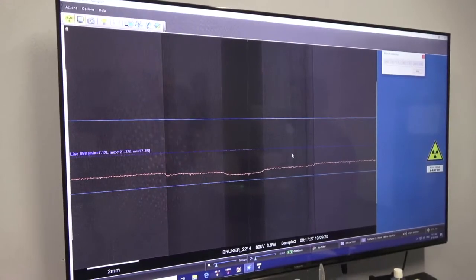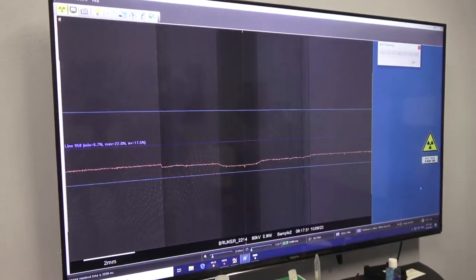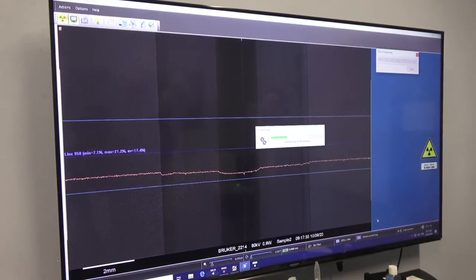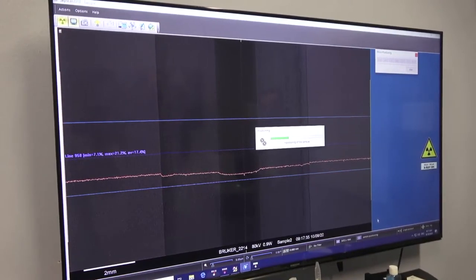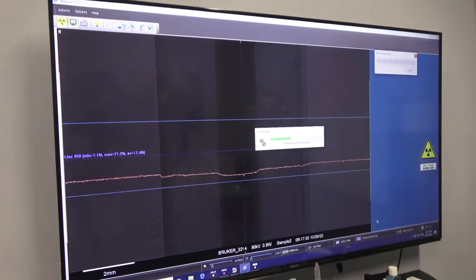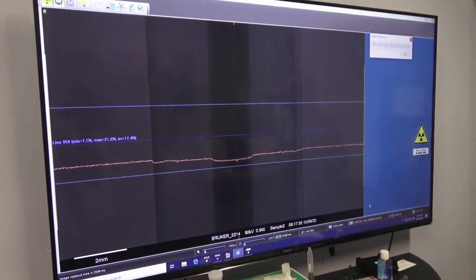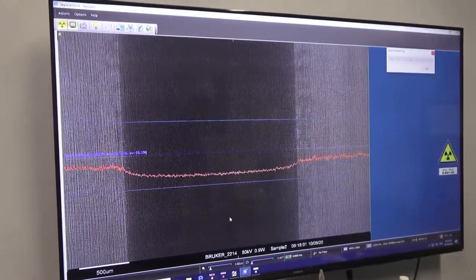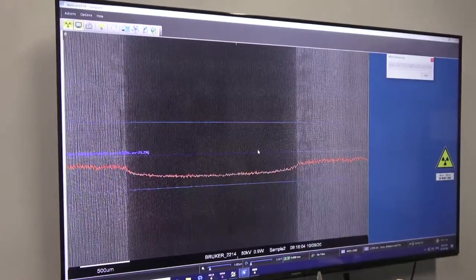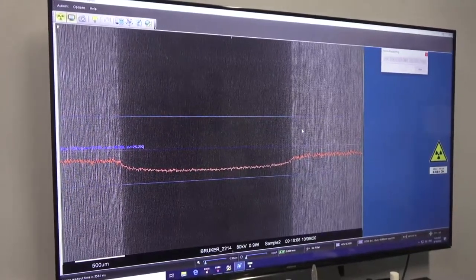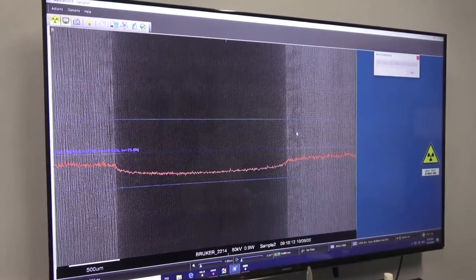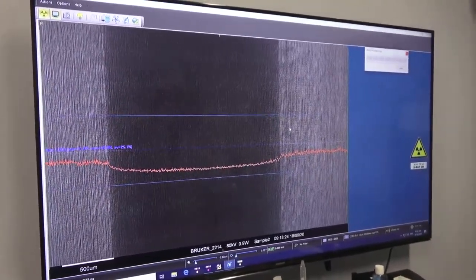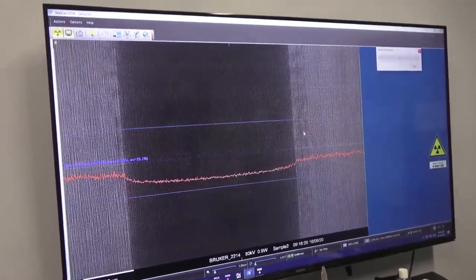Can we obtain better resolution in the projection? Sure — let me put the CCD panel in. Click of a button. When we talk about flat panel versus CCD, it's a different technology that gives us smaller pixels. Now we're down to basically one micron resolution. The dark area is the graphite core, and you're seeing structure within the wood itself. Like we talked about with counting statistics, we start to see some noise appearing. The amount of time to collect this X-ray is about three times longer than it was to collect the flat panel.